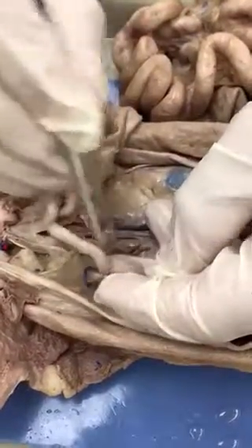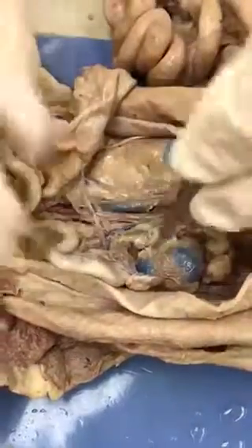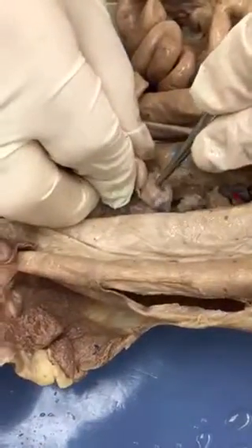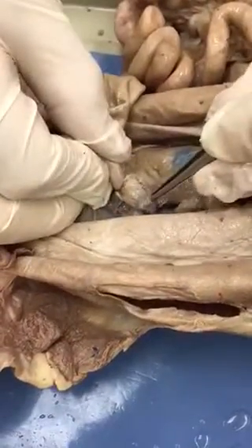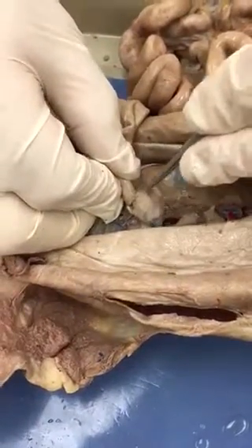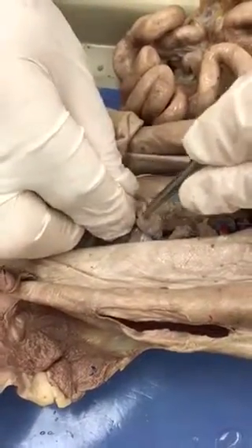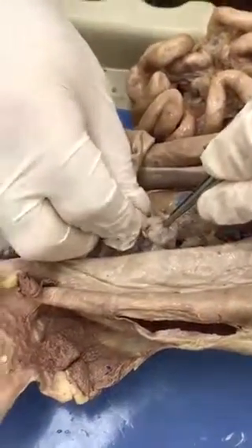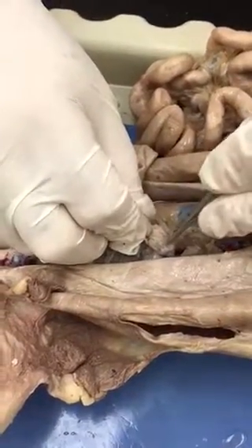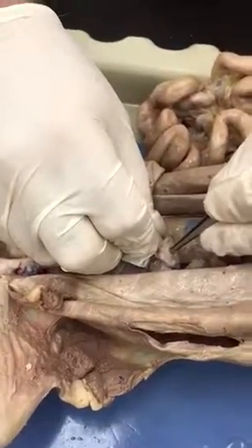Then there's a little bit that holds on to this oviduct. And that's mesosalpinx. So now I'm going to hold on to the oviduct, and I'm going to stretch it with these forceps. Okay, so just to see the last part, the third part, look, here's the actual oviduct. See it right there? Now look, if I stretch it and I pull on it, you see it's connected. What's it connected by? Some of that mesentery, which attaches to this oviduct, and that little part of mesentery right there connected to the oviduct is the mesosalpinx.